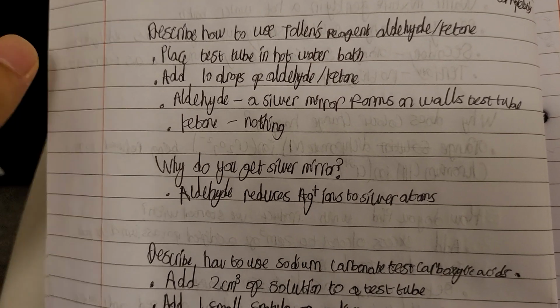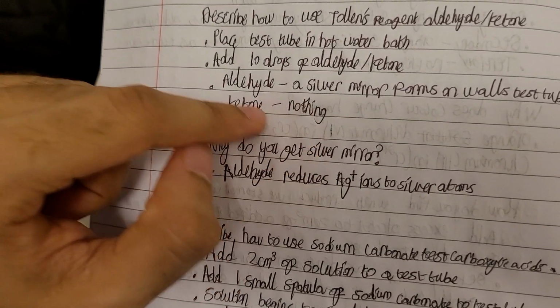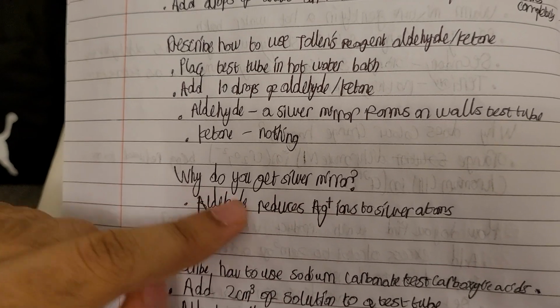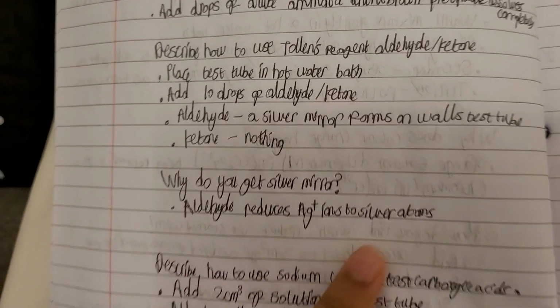So why do you get a silver mirror when you place the test tube in a hot water bath and add 10 drops of aldehyde? A silver mirror forms on the walls of the test tube because the aldehyde reduces the Ag+ ions to silver atoms.